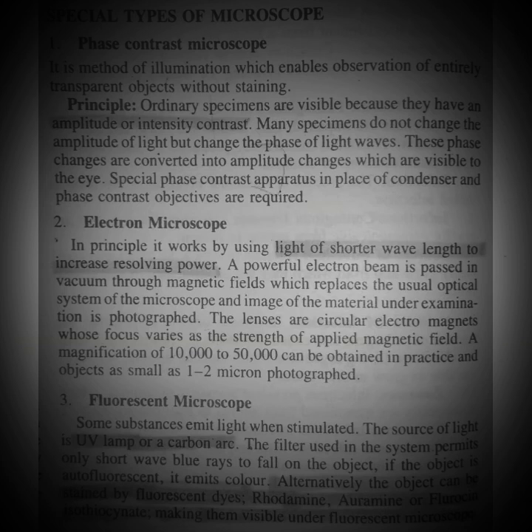So here we don't need to stain, but it will be observed contrastingly. There is some principle: ordinary specimens are visible because they have amplitude and intensity contrast. You can read from this properly, but I told you about the phase contrast.